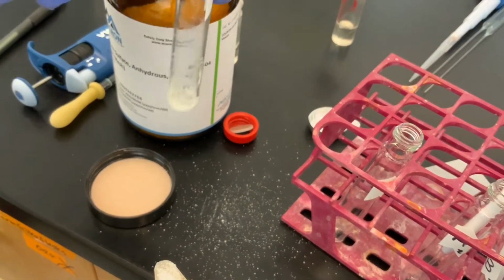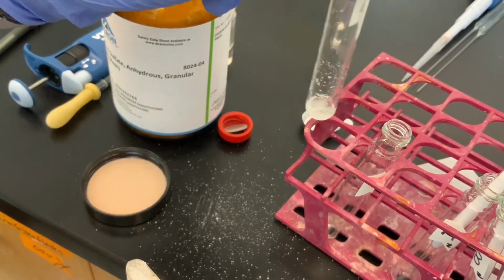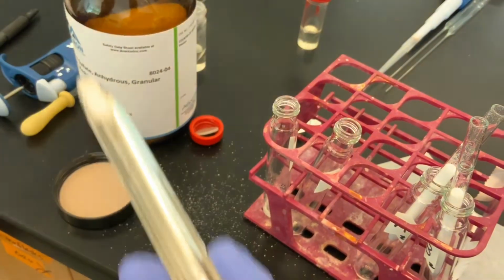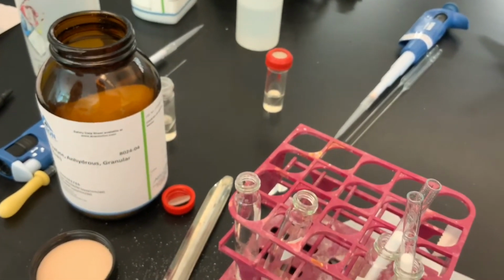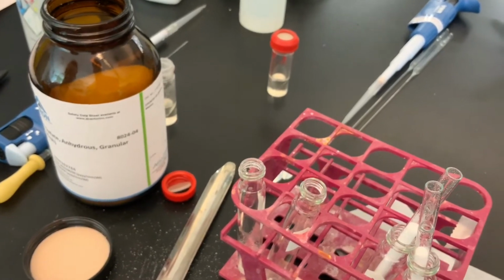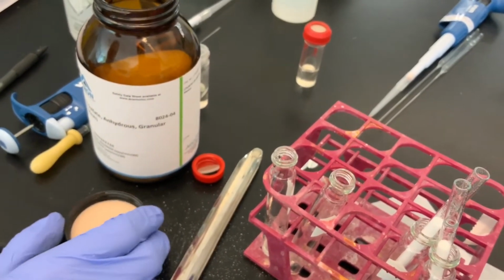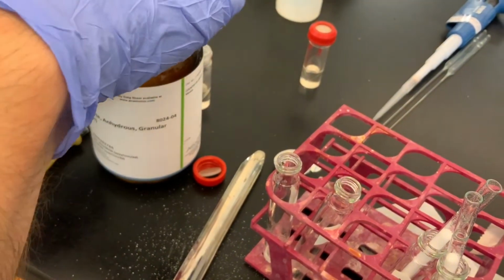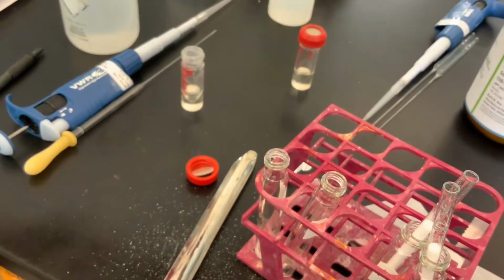All right, so now we've got some free-flowing sodium sulfate, so this is good. We're going to just let that sit for a while, because it does take some time for the anhydrous sodium sulfate to take the water out of the organic layer. But that's fine, because now we can perform part 2 while that is sitting.